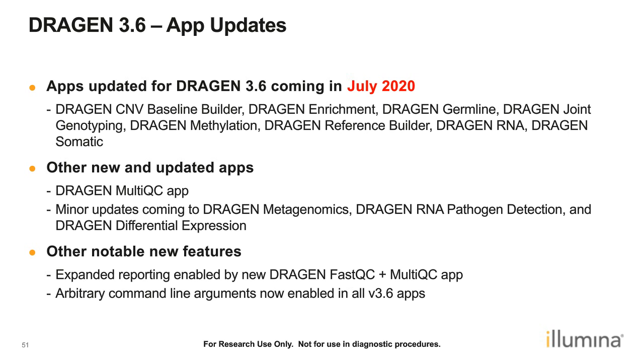And again, the 3.6 version for the on-site users is available today on our website. If you go to the website, to the DRAGEN support page, the installer for the on-site version already exists. Once again, the BaseSpace apps are coming mid-July. And then the AWS Marketplace is one of the places where we push DRAGEN to. That update will be coming in the next week or two for 3.6.